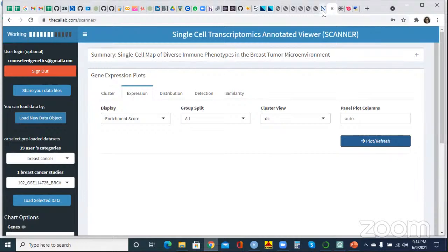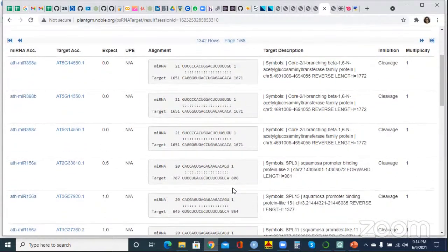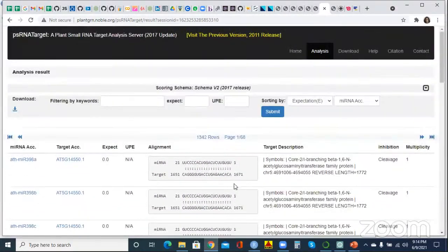So this is working. See now, this has given this. So this identifies all these. This is the targeted gene. This is the microRNA. This is the sequencing and the alignment. Everything this tool gives. So till alignment, it gives everything. And then again, you can filter and do more analysis. You can download this database as well.